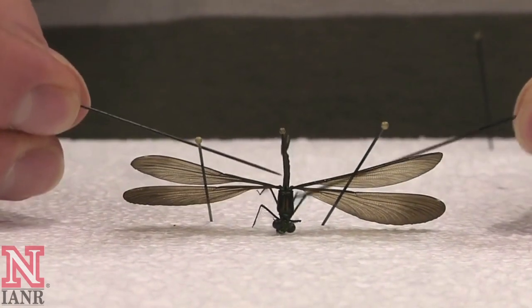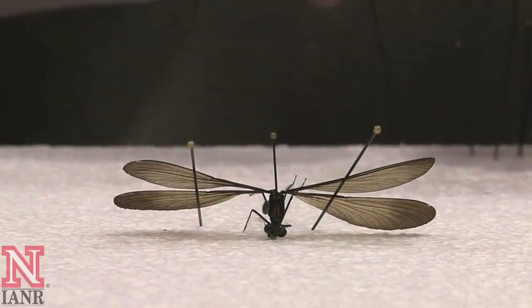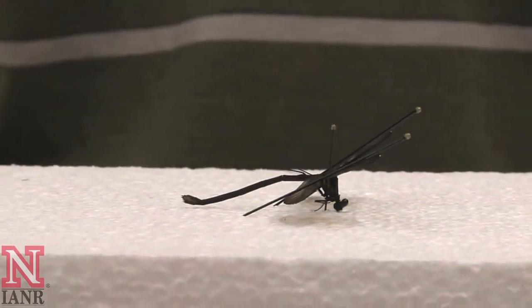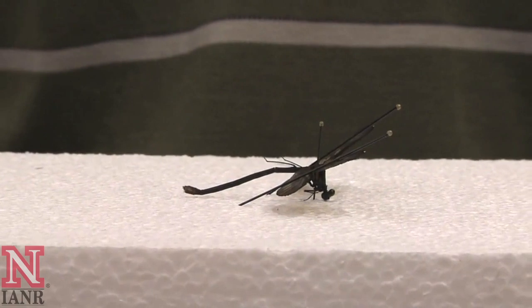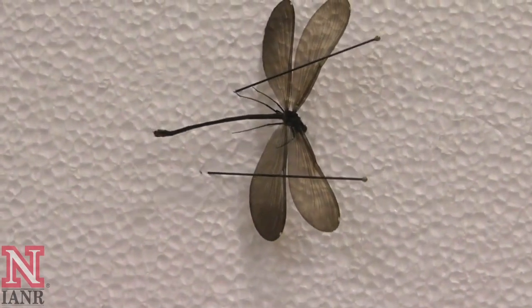Care should also be taken to keep the abdomen down. In some cases, the abdomen may need to be propped up by two pins. Positioning of the legs with damselflies is not as critical as with other types of insects, such as beetles.